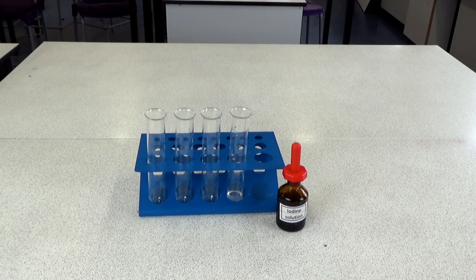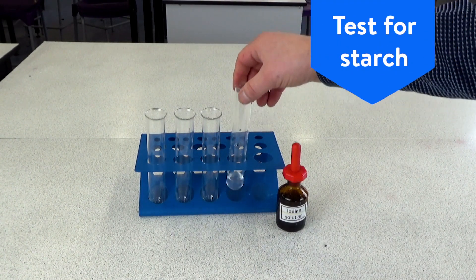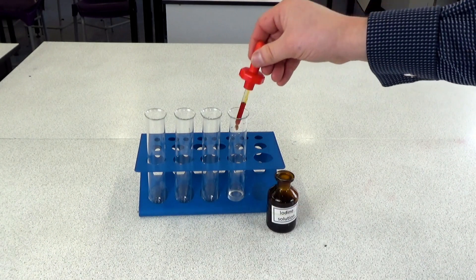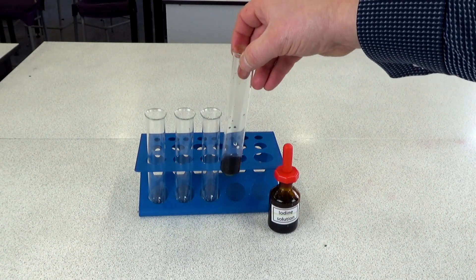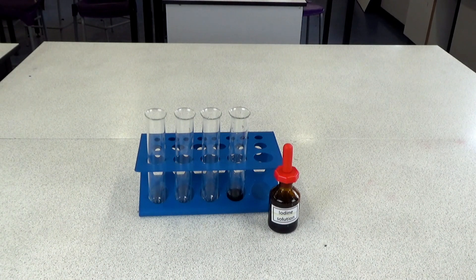It's really important that your students wear their safety glasses for the rest of this practical. Here's the solution filtered from the food sample. The first test is to add some iodine solution, and if it changes to a bluey-black colour like we can see here, that indicates the presence of starch. This test can be repeated on the other food samples.